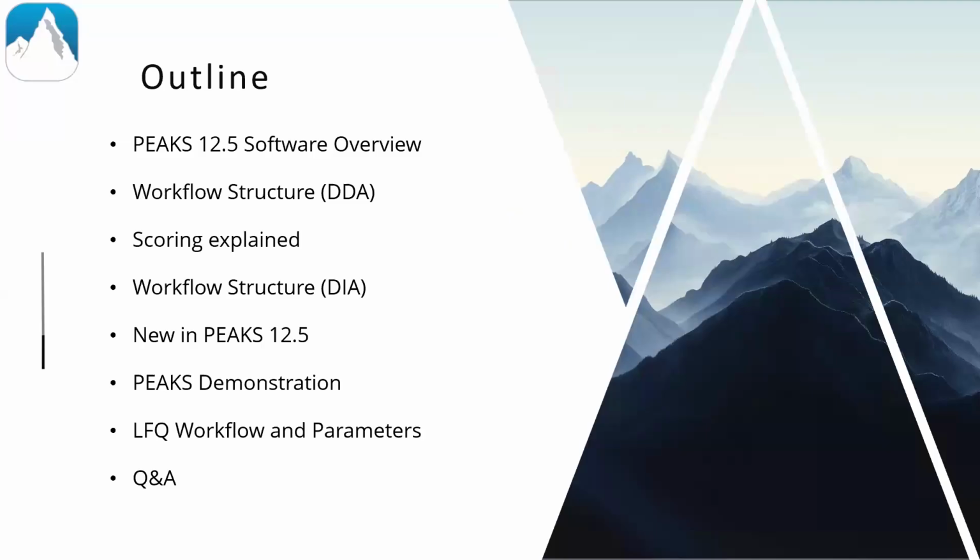So in this webinar, I really want this to be useful for both new and old Peaks users. So I'm going to do more of a deep dive into our mostly used workflows, really explaining the algorithm, how they work, and giving you some tips and tricks along the way that maybe you hadn't thought of previously. So I'll start with an overview of what we offer in the Peaks 12.5 software as a whole.